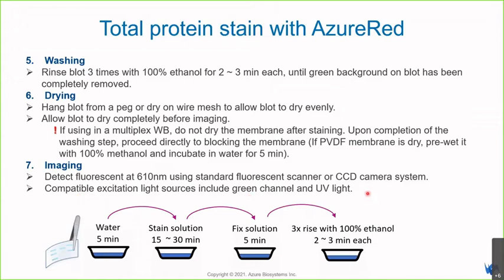Please do bear in mind that different total protein stains have different protocols and different requirements in terms of excitation, light source, and channels as well. So you have to refer to the manual and see how it works and incorporate it into your existing protocol.